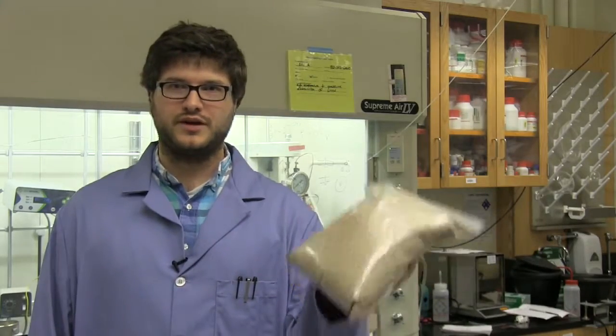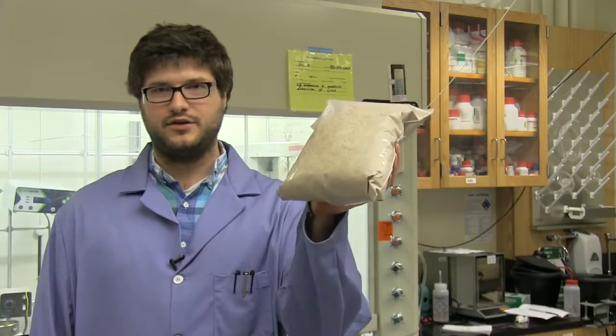So we use a lot of different varieties of biomass from trees to agricultural waste. This is about a kilogram of ground up corn stalk which was milled down to about two millimeters.